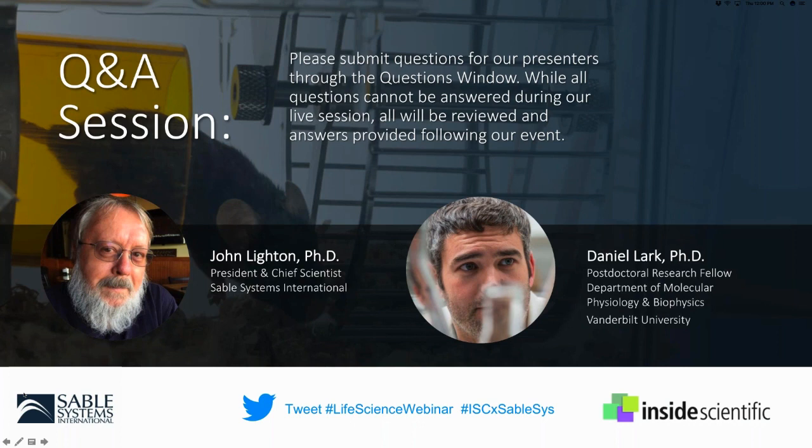Right. And another question, can you export the data from the system using other behavioral analysis programs? You can certainly export data from the system to other behavior analysis programs. So all of the information in the system, raw or processed, can be exported as CSV files. You can send given sections straight to Excel if you wish, and so on. And so any programs that can cope with CSV files and raw data should be able to be used with it. We also have R and Python utilities to read our data files directly into R or Python.